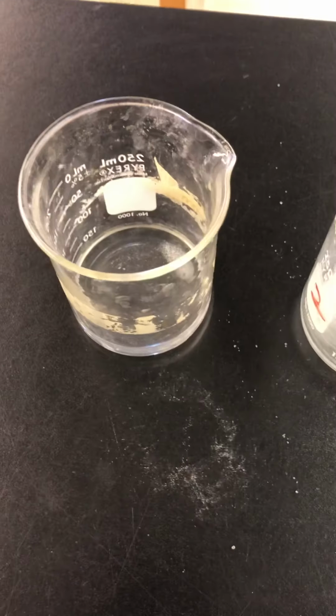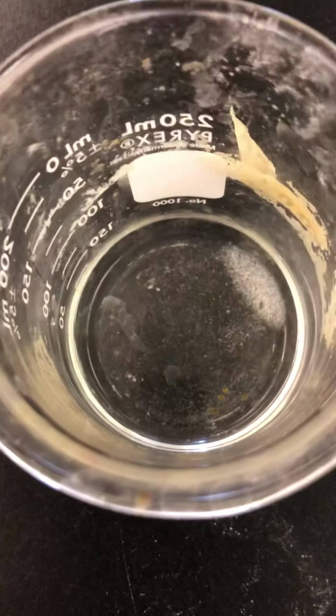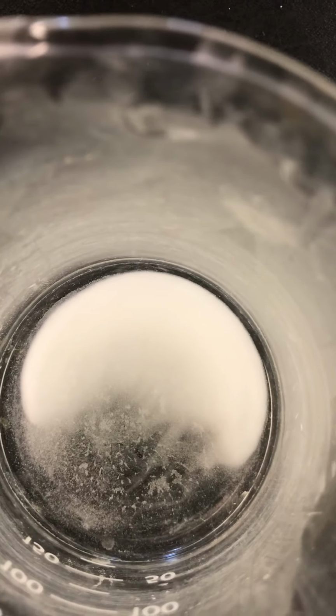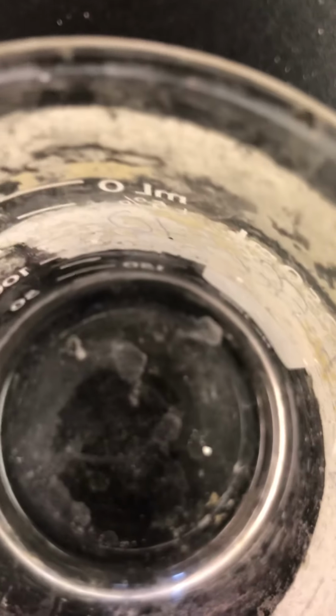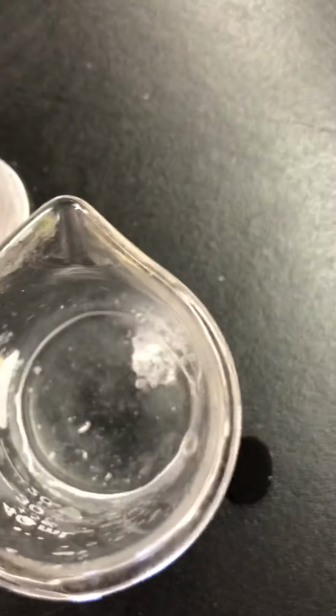Okay, so those are the 5 solids. And you can see here, here's solid 1, solid 2, solid 3, solid 4. Does look different now than it did before, so you might want to change what you said initially. And then finally solid 5.